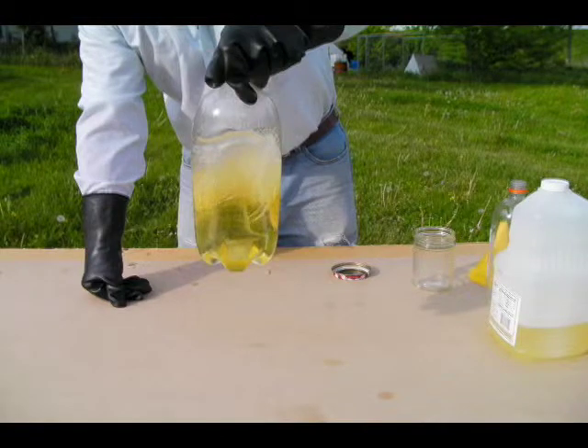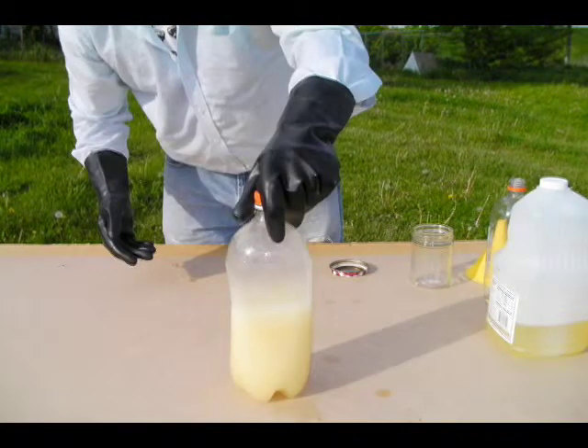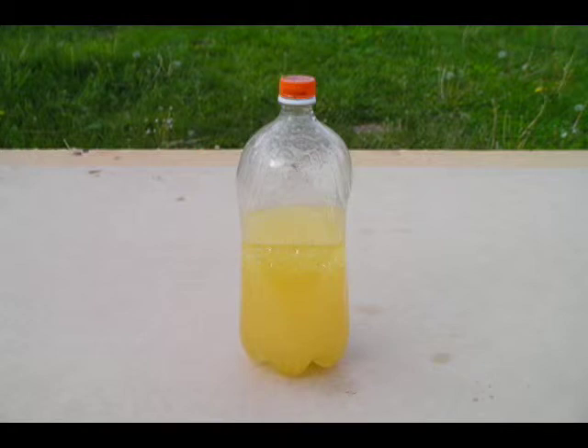Allow the bottle to stand for about an hour. The mixture will begin to clear almost immediately, and a layer of darker liquid will begin to form on the bottom of the bottle. The darker layer at the bottom is glycerol, the byproduct of the transesterification process.